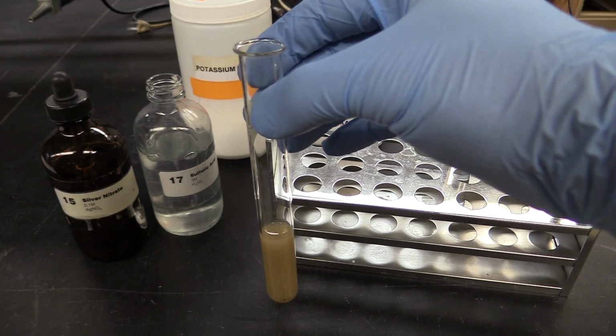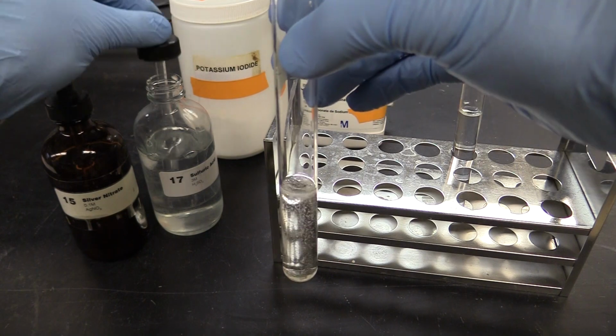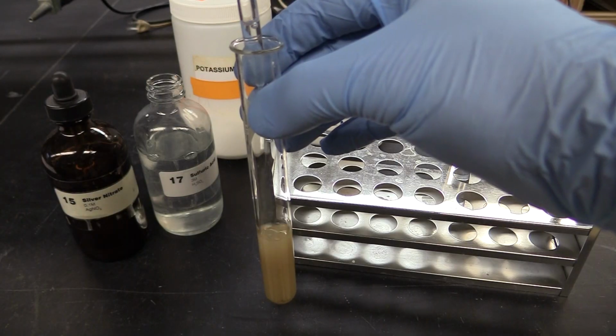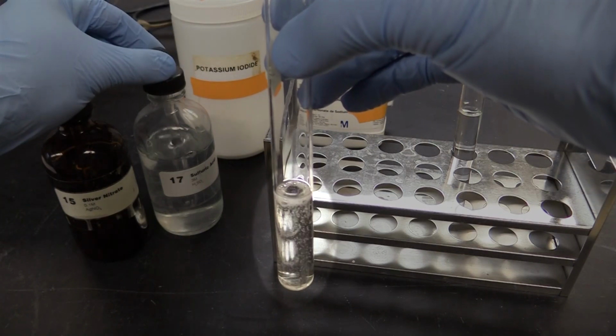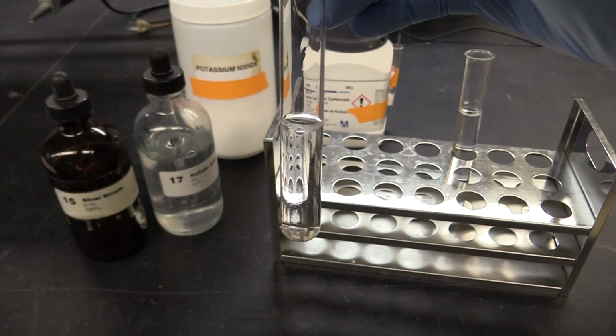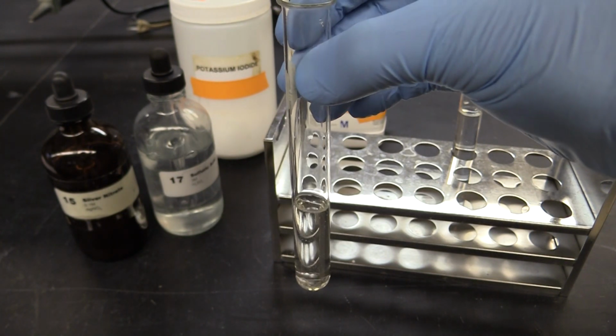And it turns out that even though silver and carbonate do form a precipitate when they're in there by themselves, they don't if we make the solution acidic. A clue as to the reason why is in the bubbles you see when the acid goes in. Acids and carbonates react in a way that other things that make silver precipitates, like halides, don't. Keep this in mind when you go to analyze your unknown data.